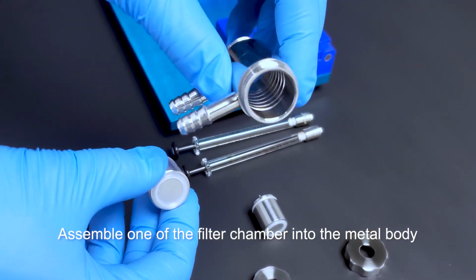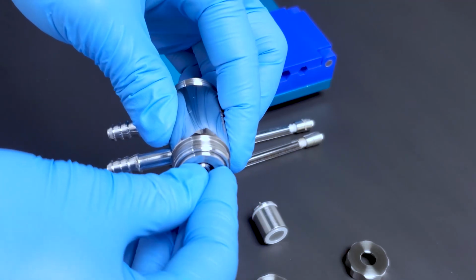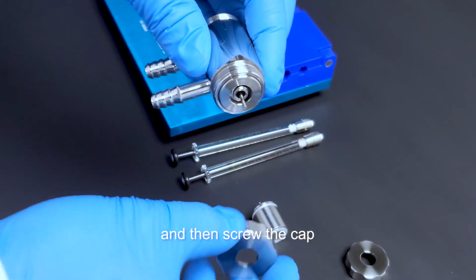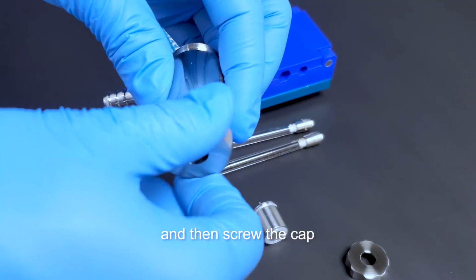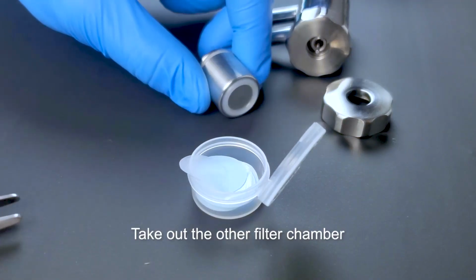Assemble one of the filter chambers into the metal body. And then screw the cap. Take out the other filter chamber.